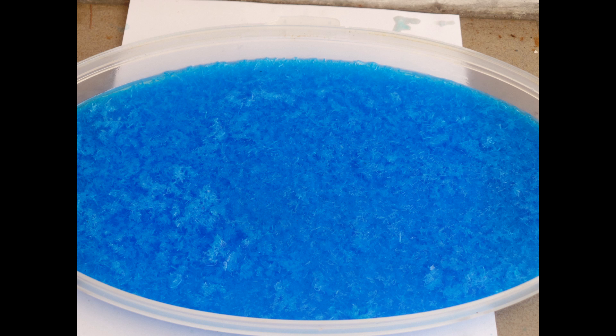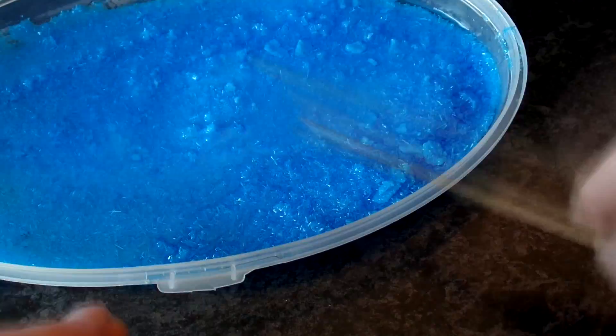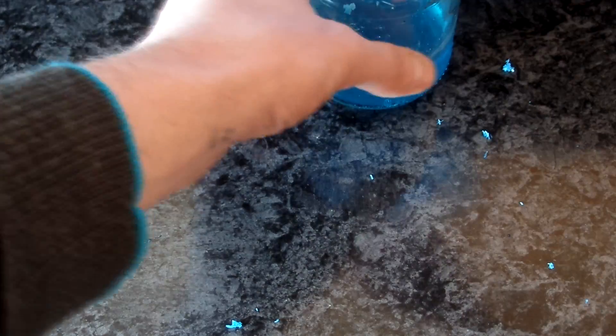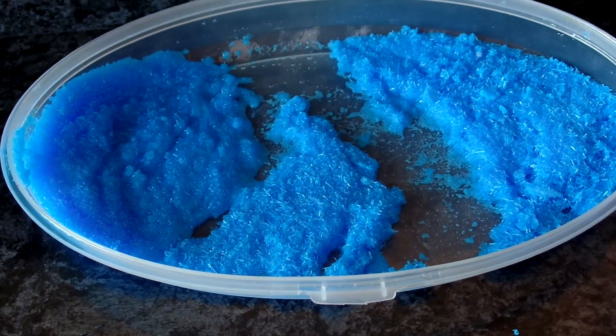Because there are a lot of impurities in the solution, I pour it off from the crystals. The solution is then put in the freezer to get more crystals out. Now we should purify this salt. There will be some losses because of it, but I have a lot so I'll just go on and do it. Crystals are washed and water is then drained off from the washed crystals.